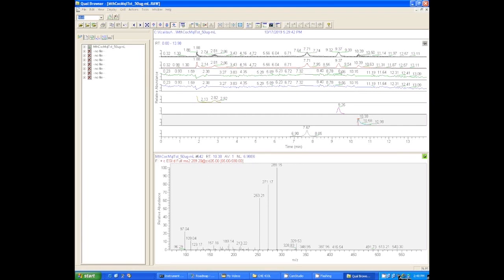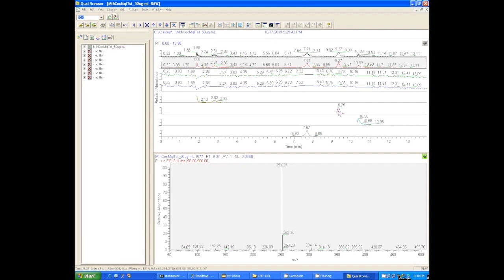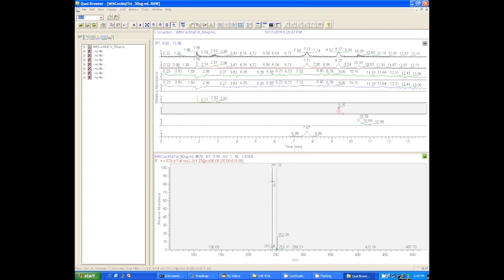When you have this combination of MS1 and MS2 spectra - if you have the MS1 spectrum for a compound and a good fragmentation spectra for that compound, and they both match the standard - then that's a definitive identification.